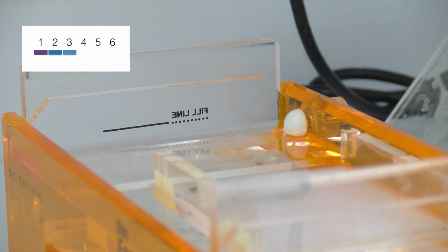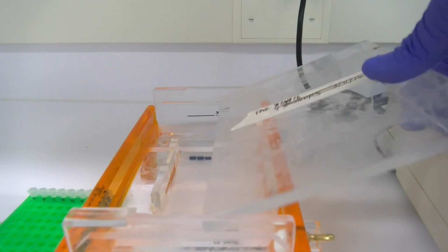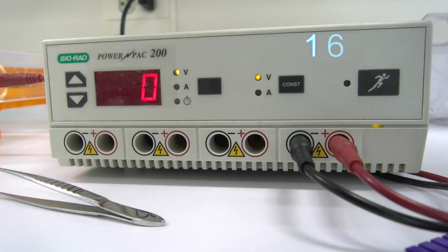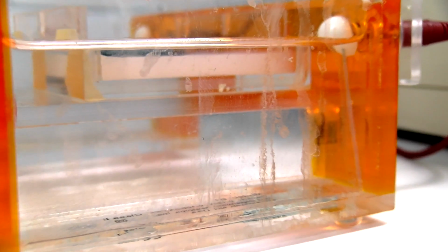In cases where we are trying to extract the fragment, make sure that you use all of your samples so that you can maximize the DNA concentration in the final product. Once we have loaded our gel, we can close the gel cage and attach it to a power supply. Typically, 160 volts is an appropriate level to get the gel to run completely through in about 20 minutes. Make sure that you see bubbles coming up from the side of the cage to ensure that the gel electrophoresis is actually active.